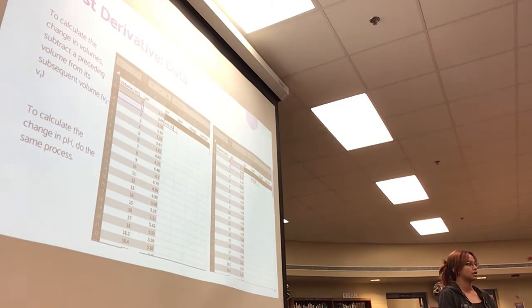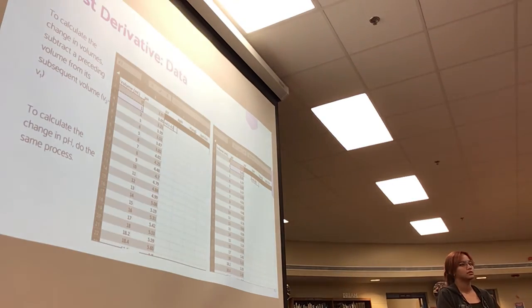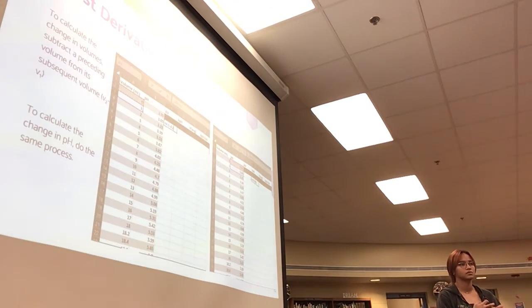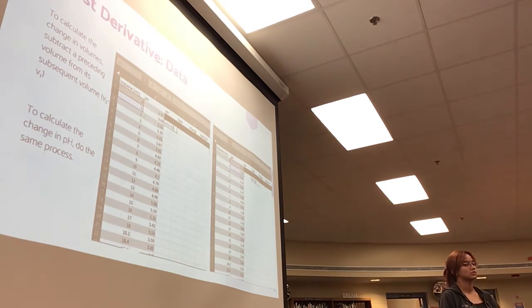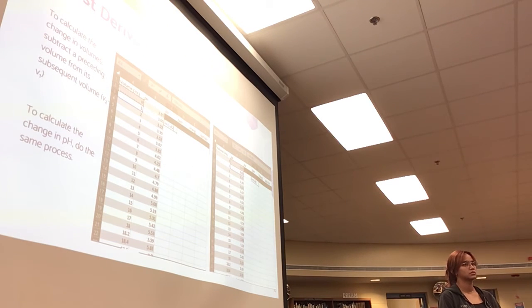Oh, so you just get limits? Yes. Remember that this is not a regular function. You have the data, so you are not expressing the function. Actually, you are calculating the derivative over the data. So even if you don't see it, you're going to see that it has one. And actually, the first derivative is not going to tell you so many things, but the second derivative is going to tell you a lot.